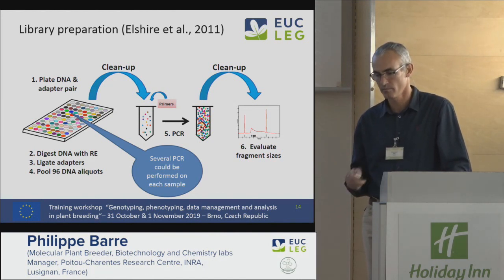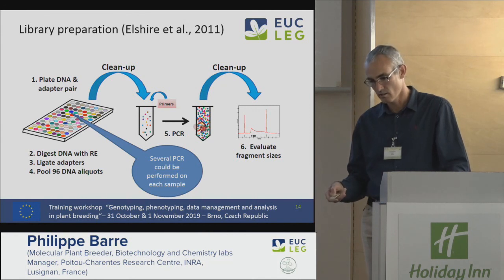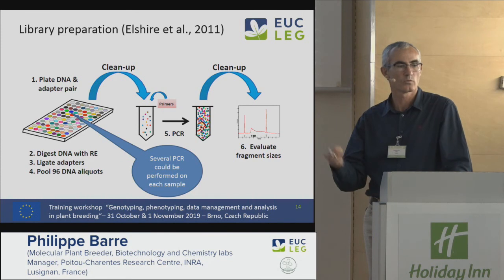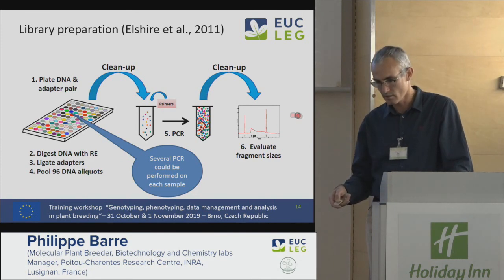And then you check the size. So this here gives you the size of the fragment, and these two, here and here, are standards where you know the size, and the library is in the middle here, and you check the size.